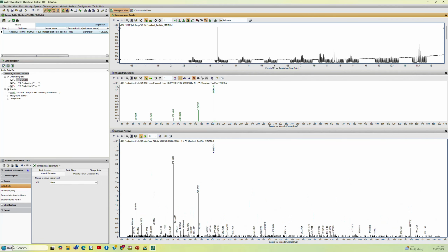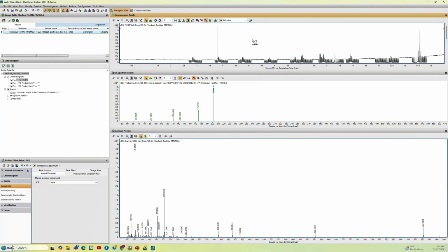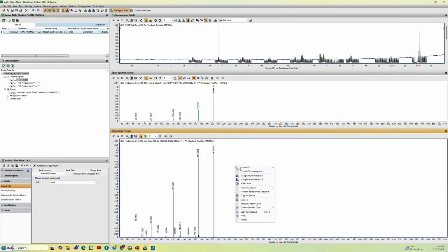You can see there's not much signal there. But as you start to get over here, you can read this. This was at the bottom, you can see the fragmentation energy, and this is CID 40. If we go to the next one, just keep paying attention to what's changing here. This would be no energy. It must just be the MS. You come to the next one, it's gone to a CID of 10. See that 10 there? And the next one's gone 20. It's 40.